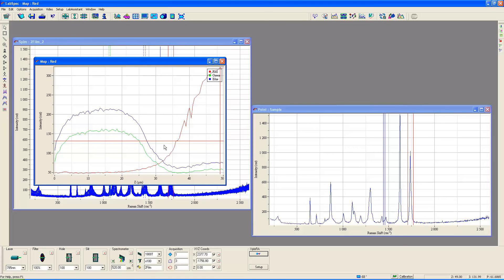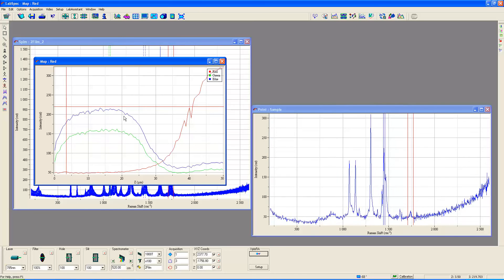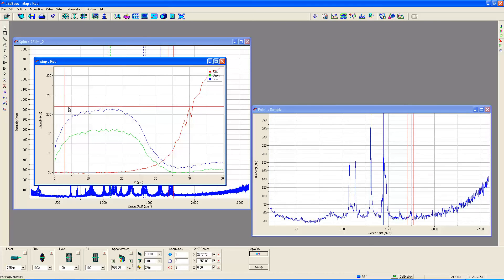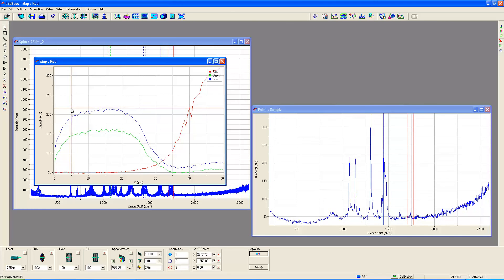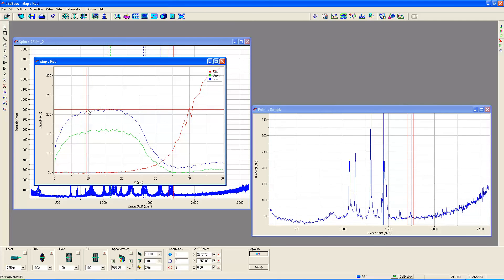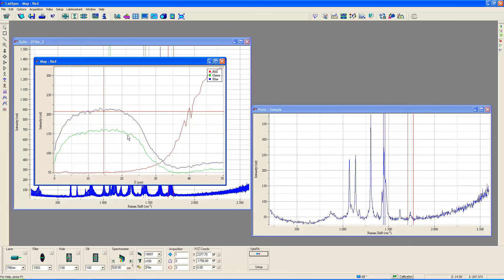If you wanted to identify the particular spectra acquired at any location in these depths you could do so by moving the cursor in this profile or map page and then you see over here is the spectrum associated with that particular position. So now we're at a position of basically five micrometers. That's indicated down here, it says five. That's at five micrometers and this is the spectrum acquired at five micrometers.